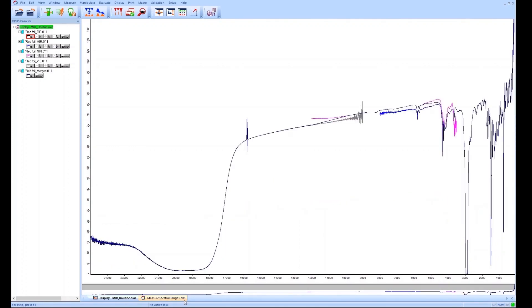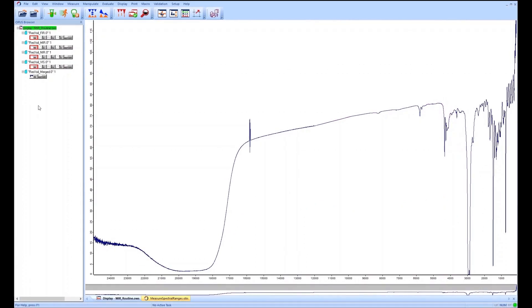With this kind of measurement we create single spectra for every spectral range, but optionally we can click on 'merge spectral ranges' to end up with one single file which contains the information of the whole measured spectral range. The single spectra are not lost — it's just an additional Opus file created with this function. Hopefully I could show you how easy and intuitive it is to measure. Thank you very much.